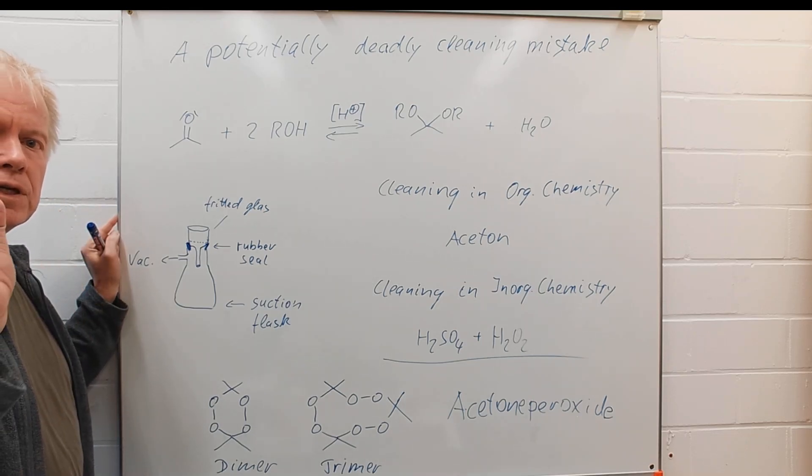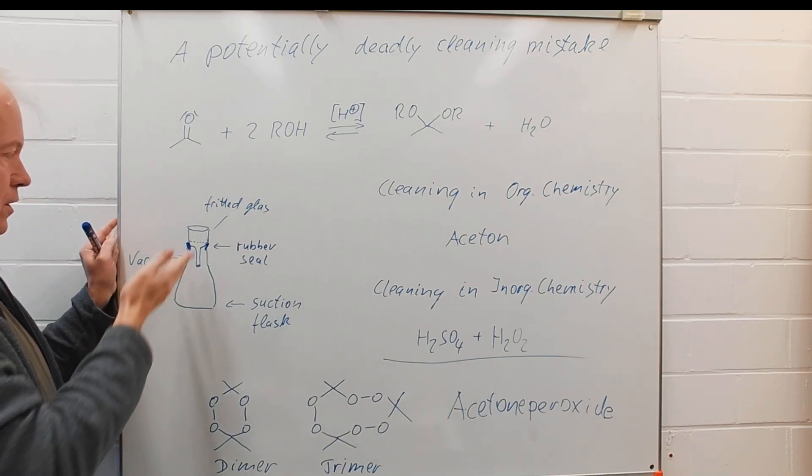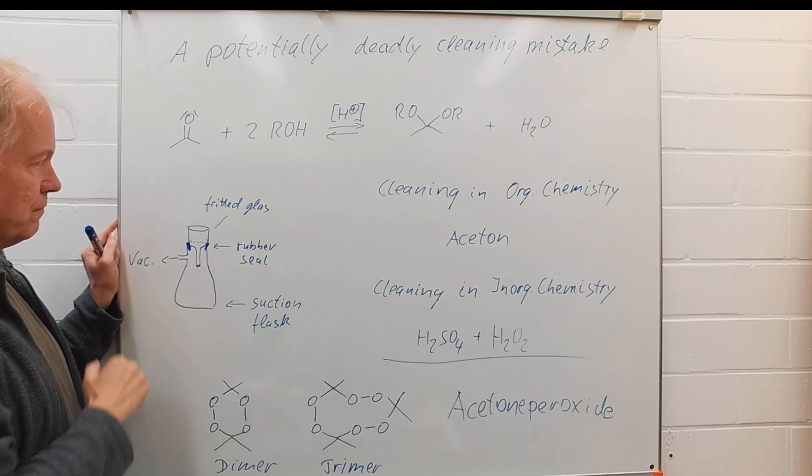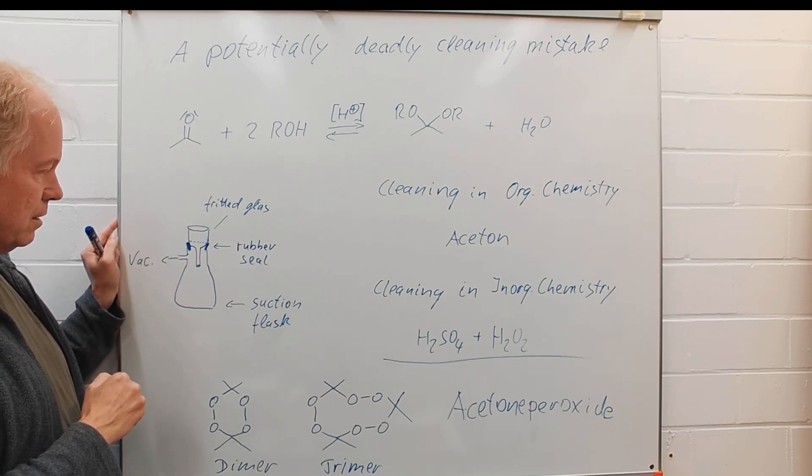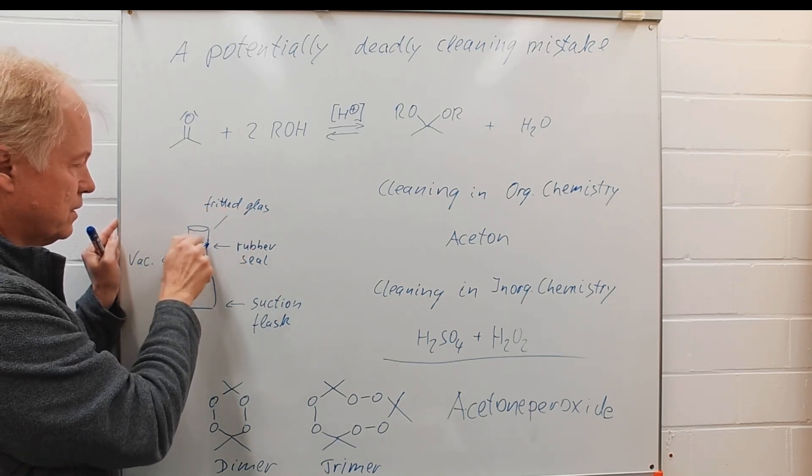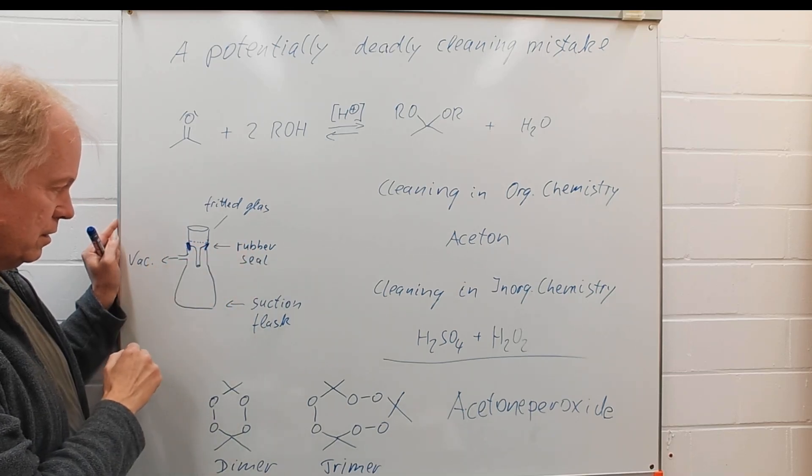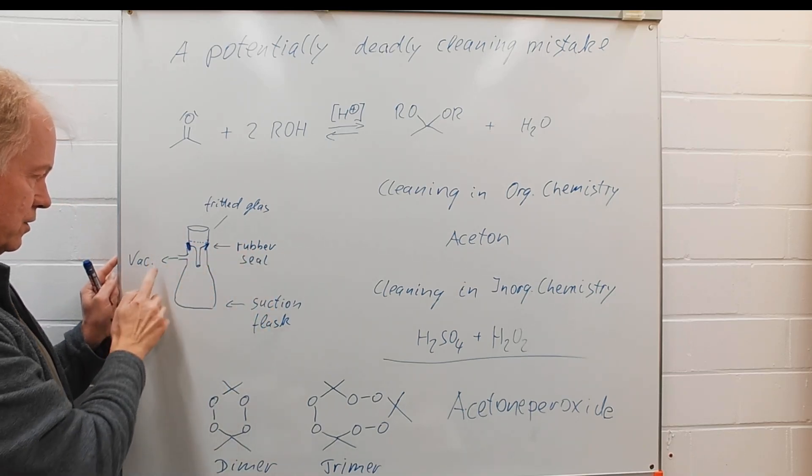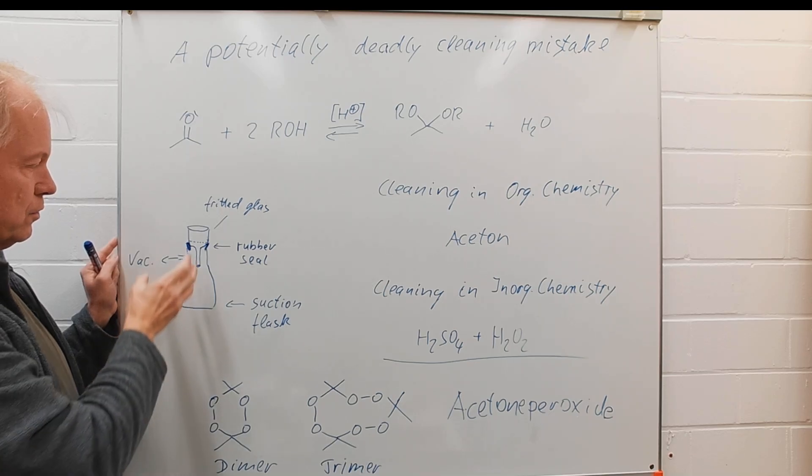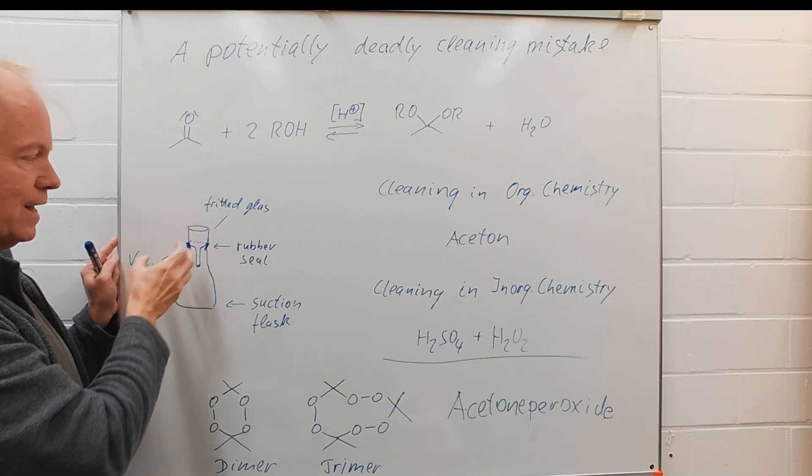Now to the cleaning problem. Let's assume we have this type of setup: we have a fritted glass here, this rubber ring or rubber seal, and a suction flask with vacuum applied. We use something like that for filtering off solid material in reactions in organic chemistry.